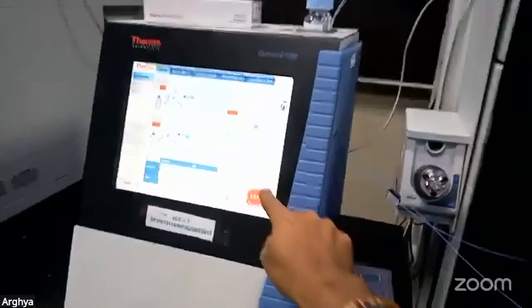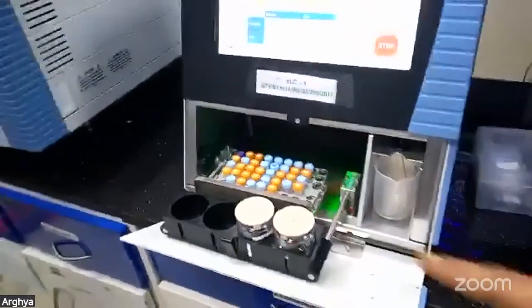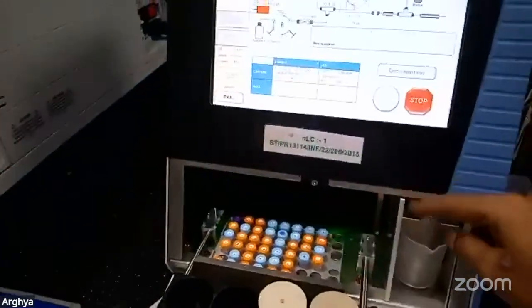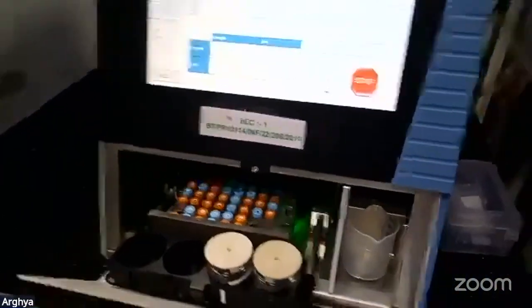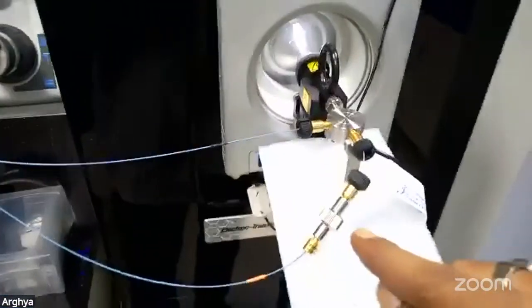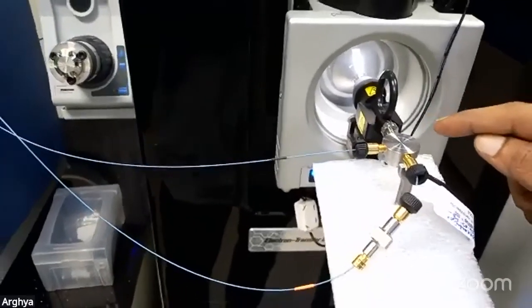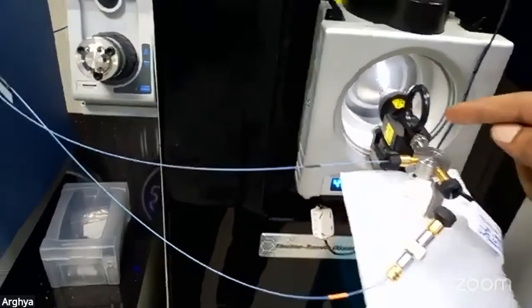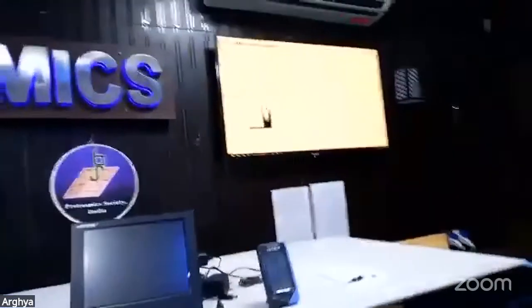As you can see, you can place your samples inside. Once the samples have been placed, they can be injected, and from the solvent mix, the samples are eluted out to a trap column. From the trap column, it goes to the main separation column, the RPLC column, which is the C18 column, and then to the mass spec. And you generally acquire data like that.